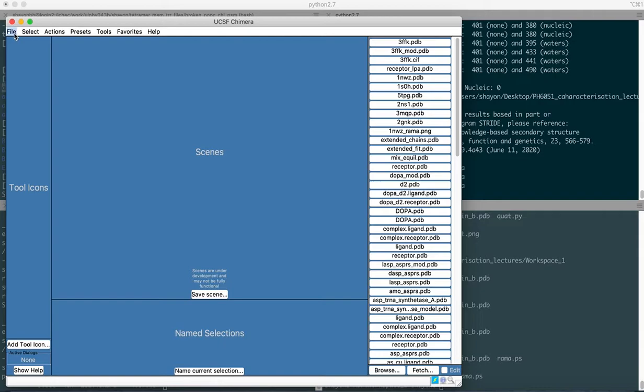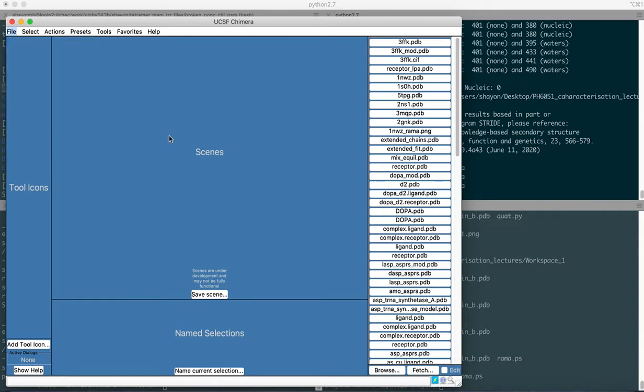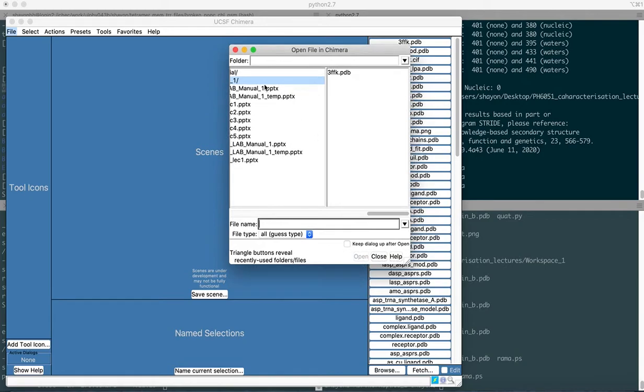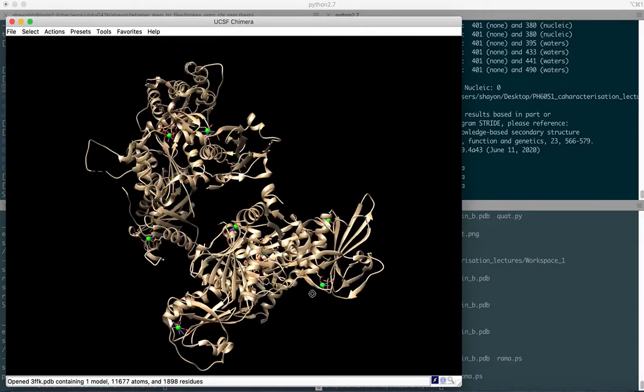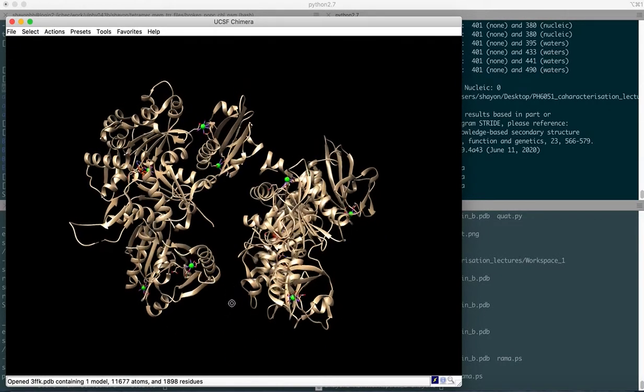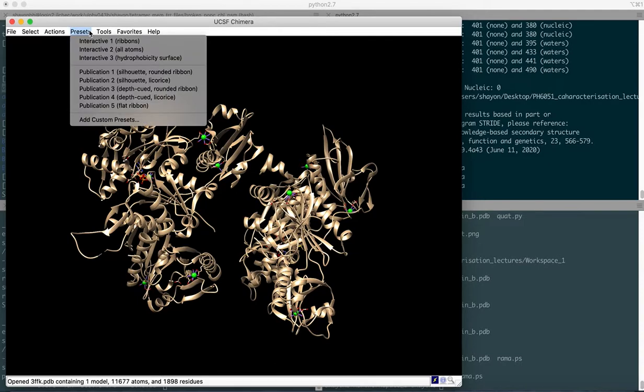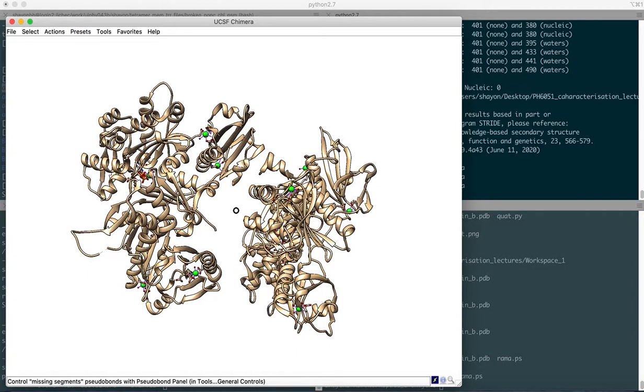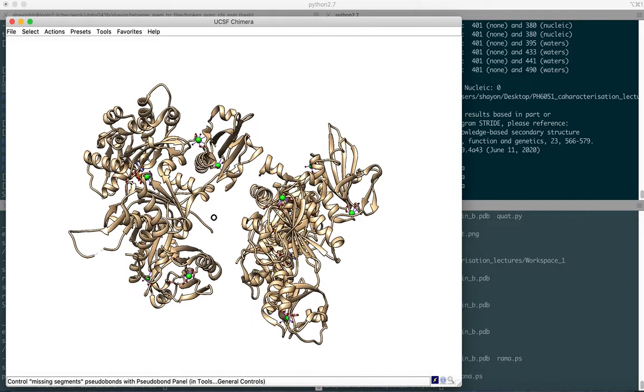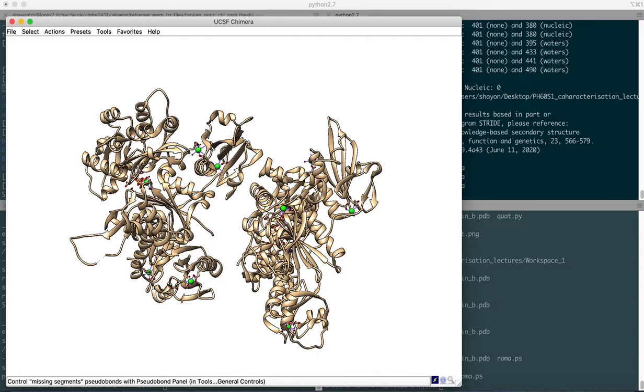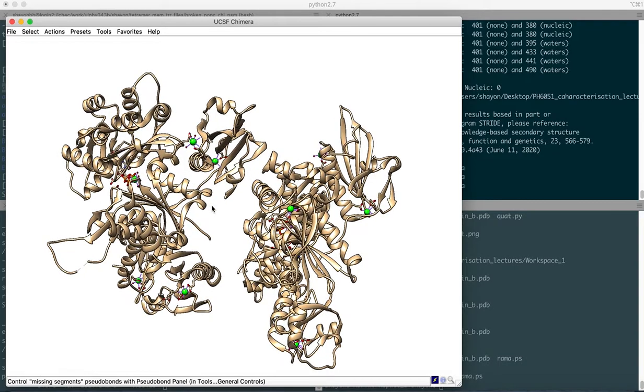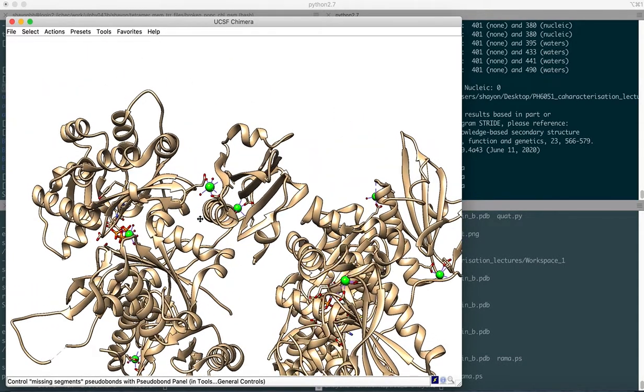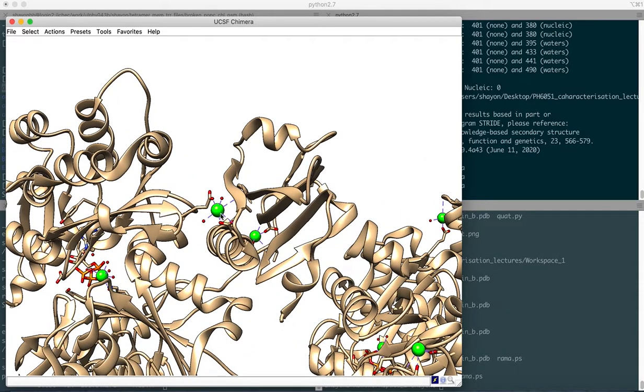First, we'll load up our structure in Chimera, which is the 3FFK molecule PDB ID. I'm already in the working directory and I select 3FFK.PDB and open it. As you might have seen from the previous tutorial, I like the representation with the publication 1 preset template in Chimera. It sets a white background and the ribbon representation is beautifully shown. You also see the separate representations for the calcium ions in lime green color, and if you zoom into it, you'll find that the metal coordination states are already represented.